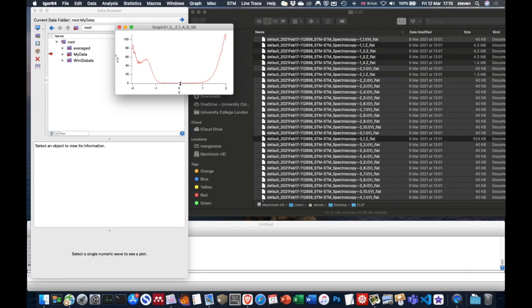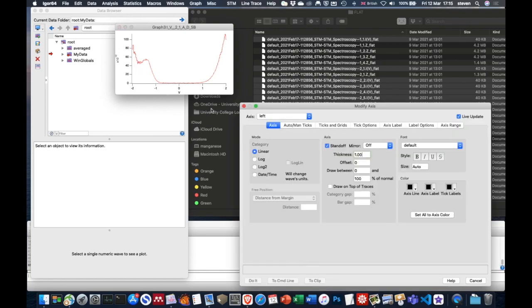So we're expecting the silicon band gap to be about 1.1 eV. When you include the surface states, it gets even smaller than that. So this kind of looks a bit too wide. But part of the issue here is just how we're displaying the data. So if we look at this on a log plot, okay, it's still not fantastic, but it's a lot better.